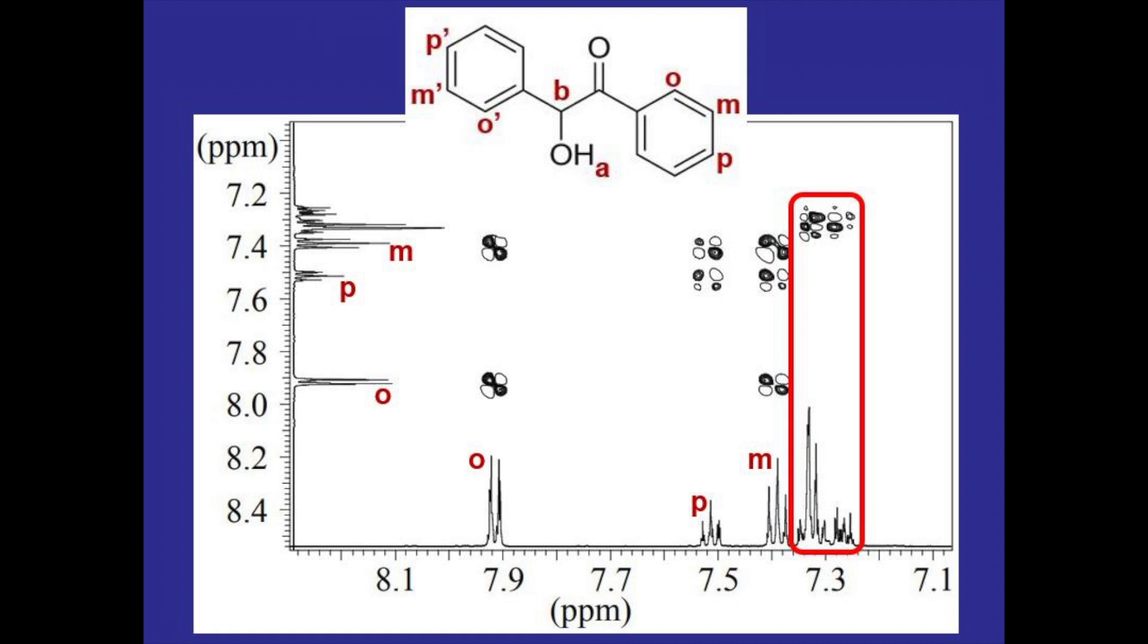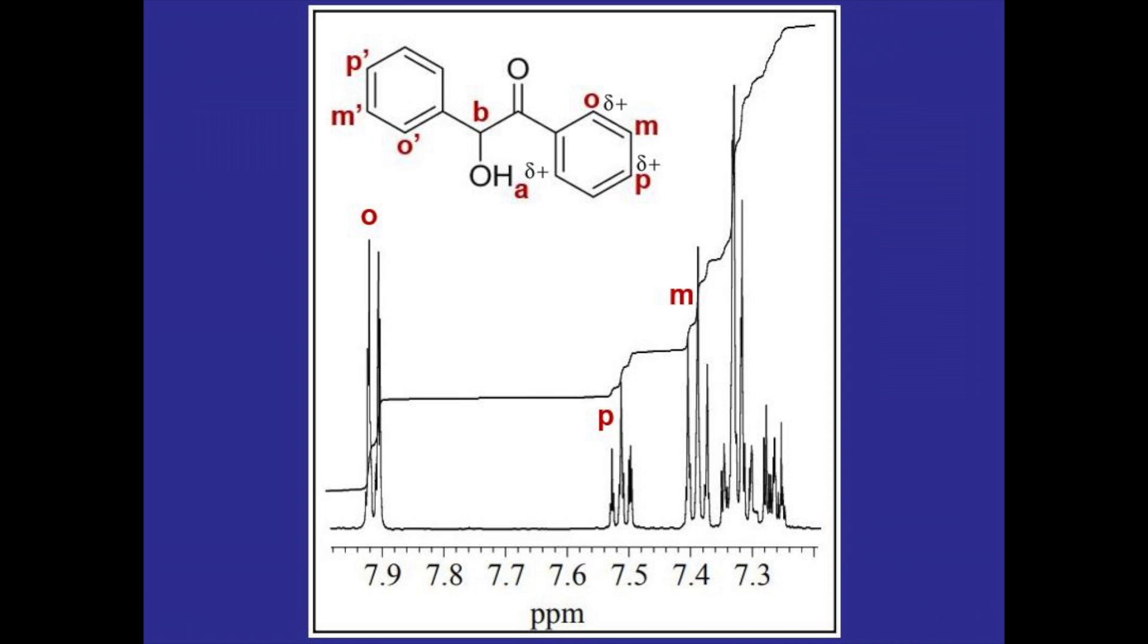The peaks are in the aromatic range so we know that they're going to be for O', M', and P' but to figure them out I'm going to look back at the zoom in. It looks like there are only two peaks left for the three hydrogens so there's got to be overlap somewhere.